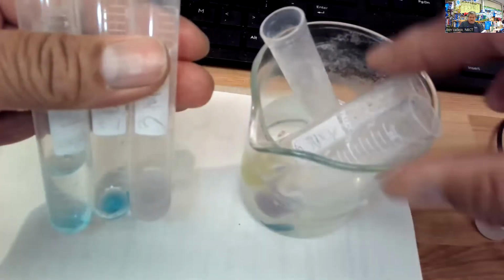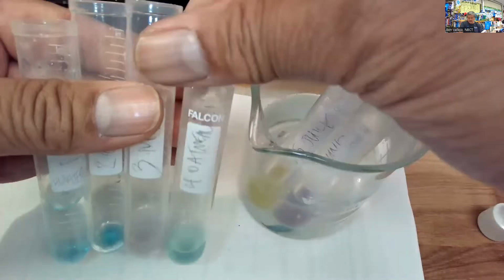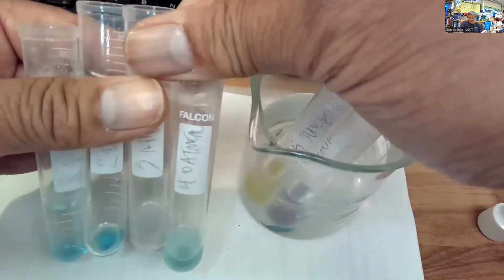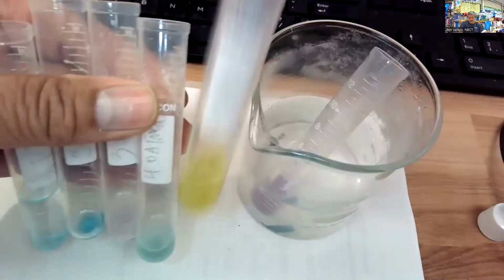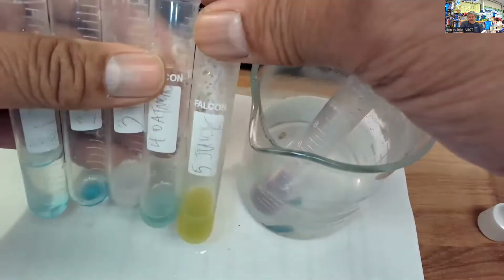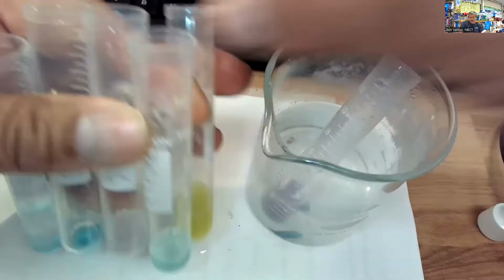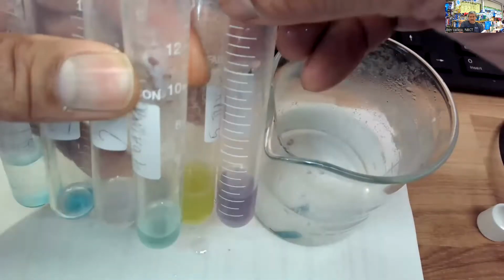Okay, there. And then for 4, 5, 6, here's 4. Looking for a simple sugar. Doesn't look like there's a simple sugar in there, but there's definitely one in the juice. You can see it is very apparently different from all 5 of the other tubes.